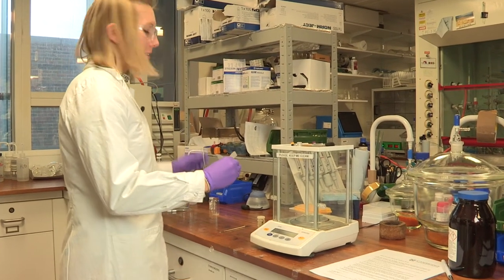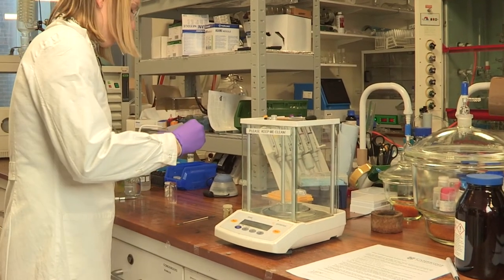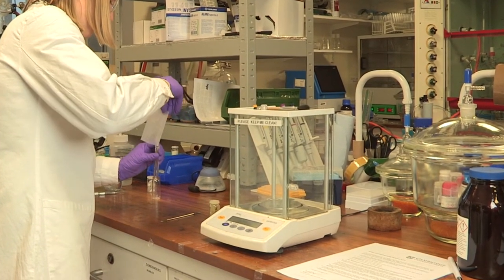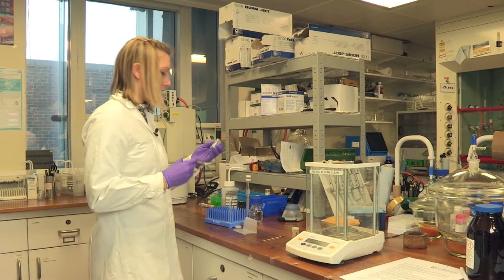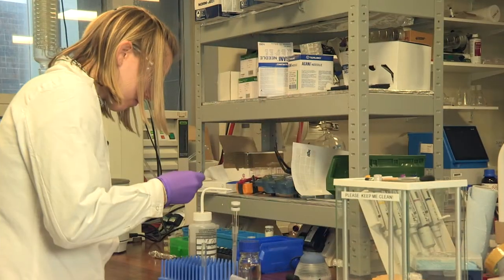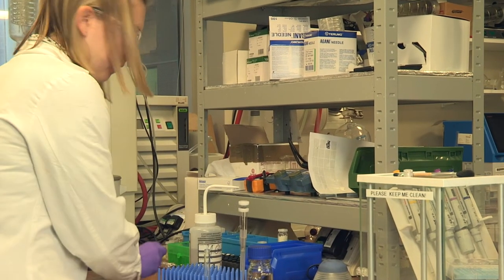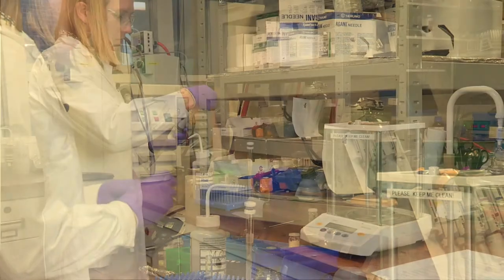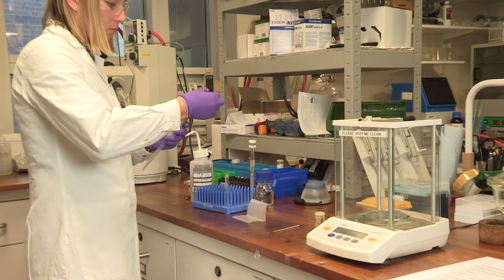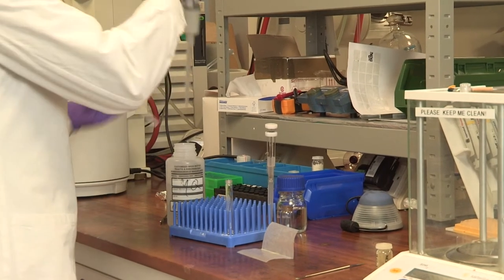Now I'm just adding this to the vial I use to stick it in the sunlight. And here's our plastic water bottle. And now we just need to put everything in the water.